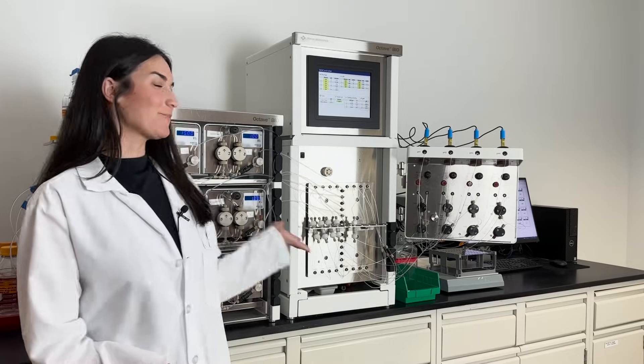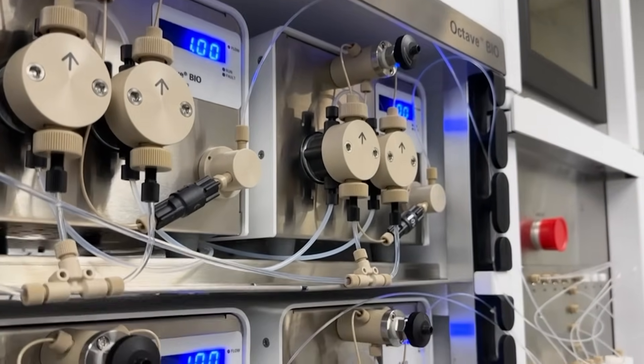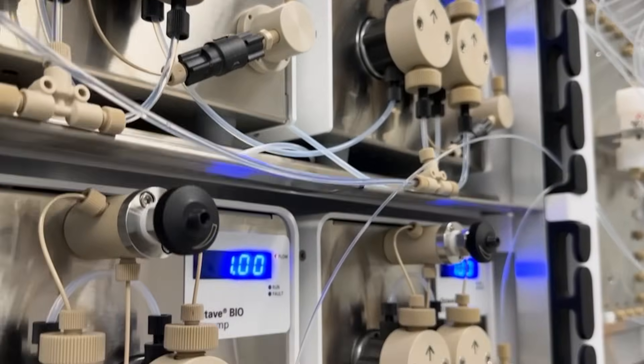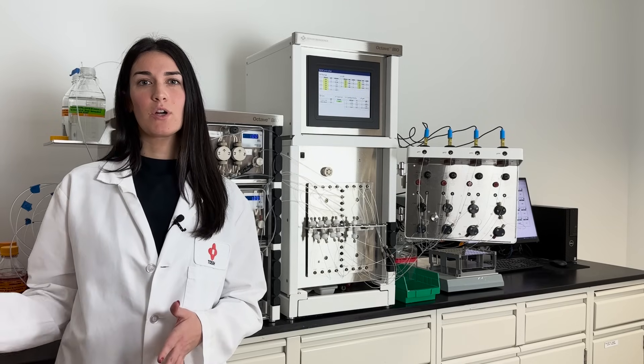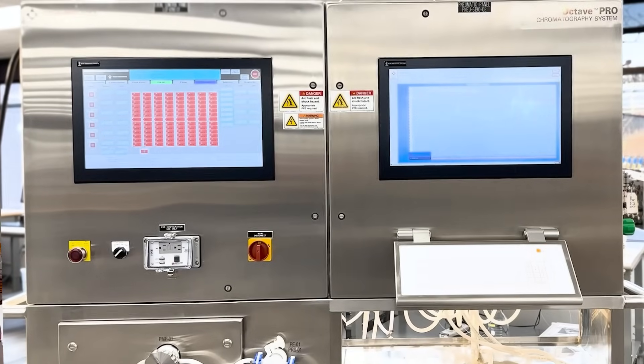The Octave Bio, pictured behind me, is our benchtop system for multi-column chromatography. It's mostly used for process development and then scale up. And once you're ready for clinical and commercial manufacturing, we're ready to scale up to the Octave Pro.